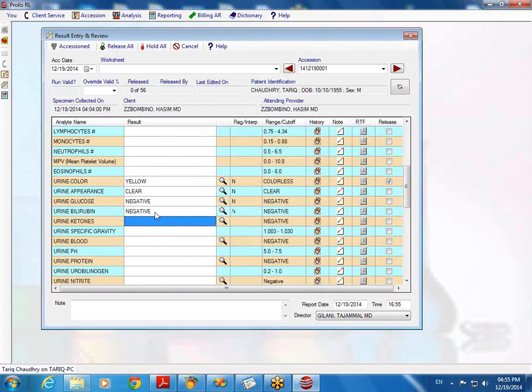Okay. So let's say for one of the analyses you process 20 patients, can that information be imported via a spreadsheet, or would you have to type every single one? Imported like what? Like an Excel spreadsheet.